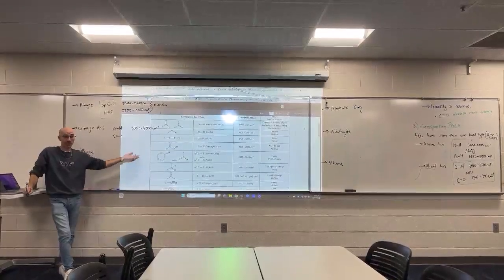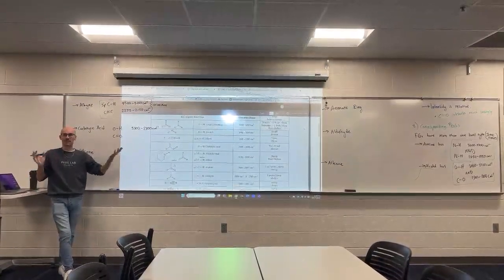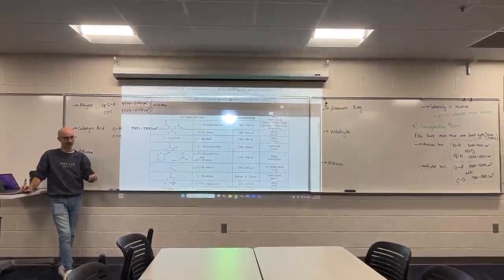And I think I showed you guys more than one carboxylic acid absorption, and they do look different. Unfortunately, they're the least consistent.